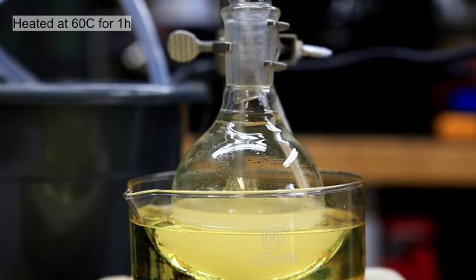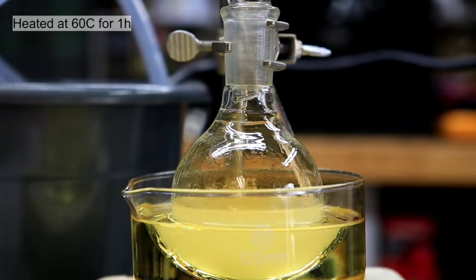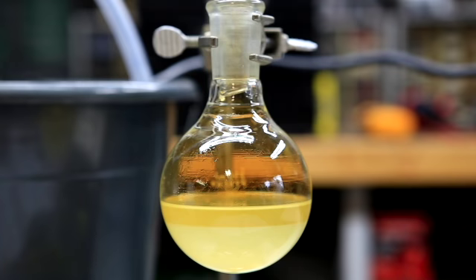After all the benzene had been added, the solution was a faint yellow color and was heated to 60 degrees Celsius for 1 hour. It is important that the solution is not heated much more than 60 degrees Celsius. After the 1 hour, the solution was allowed to cool, and you can see that 2 layers have formed.